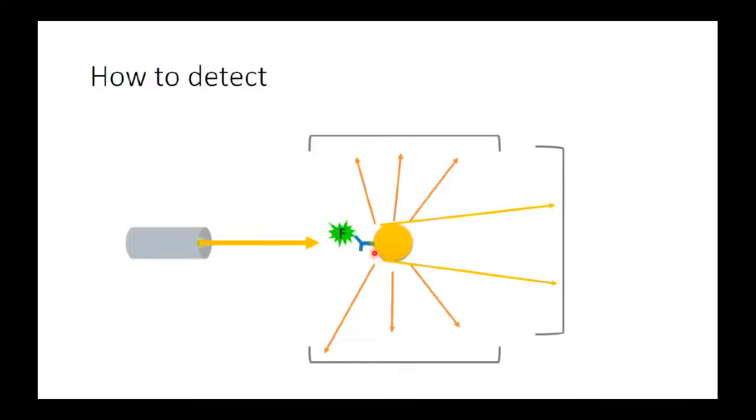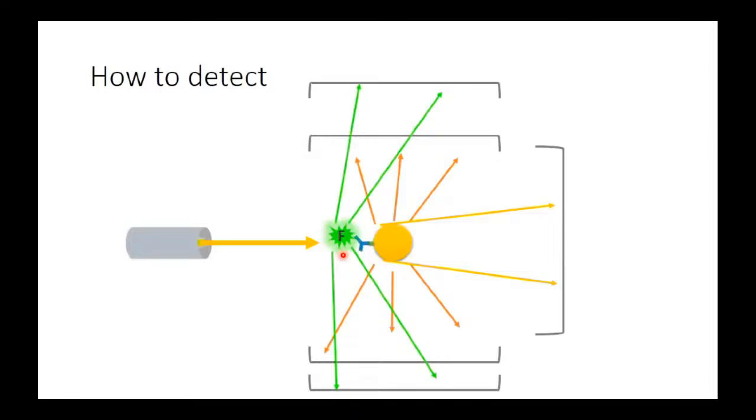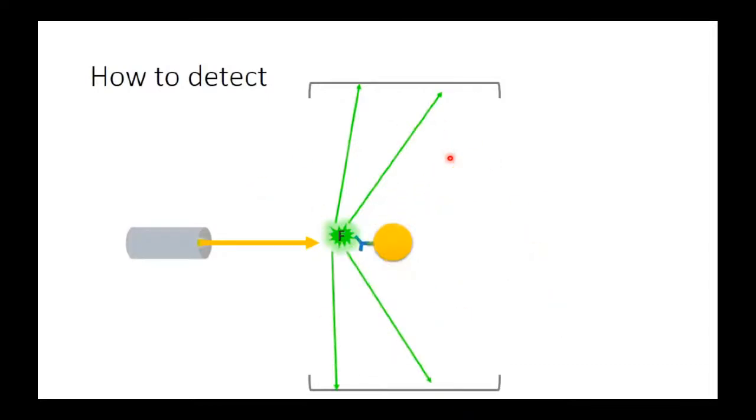And then when the fluorophore passes through the laser beam, it will be excited, and when it is excited, it will emit light at a particular wavelength, and this light will be detected by the fluorescence detectors. All these detectors are connected to the computer, which is going to give me the exact data about every one of these events.